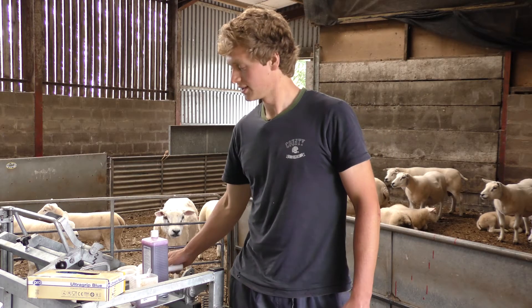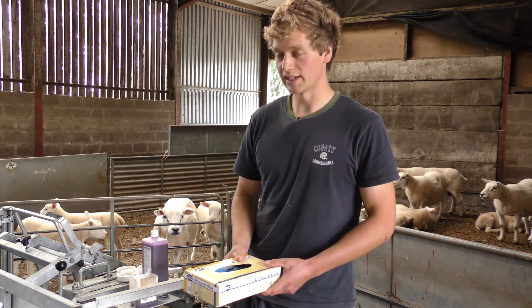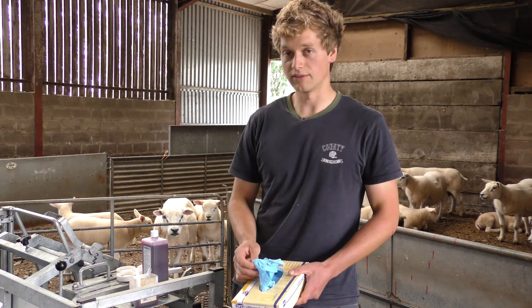Once you've rinsed away the paddle, it's very important then to throw away the gloves and put new gloves on for the next ewe.